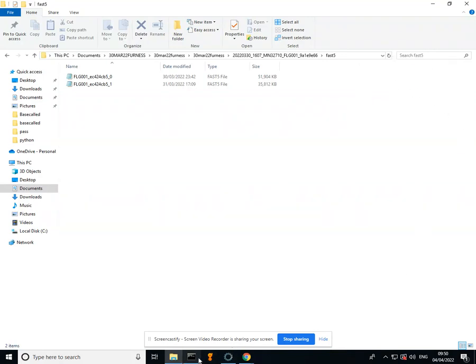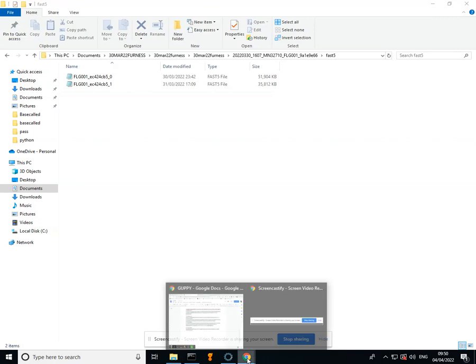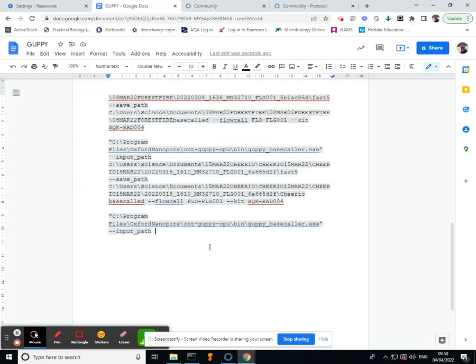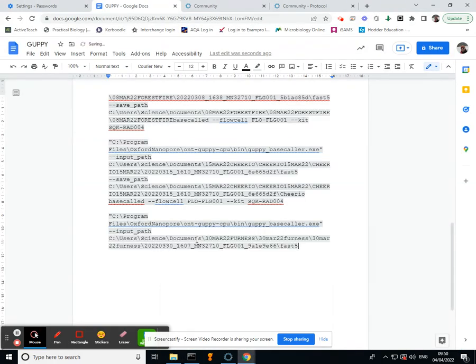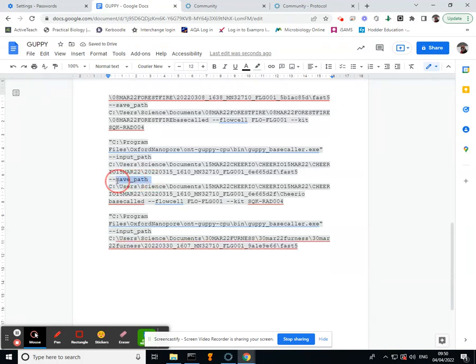So I go back into my document and hit Control V, then make sure I put in one more space before hitting this save path.